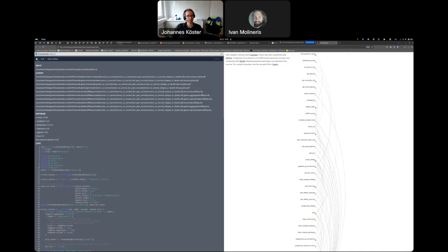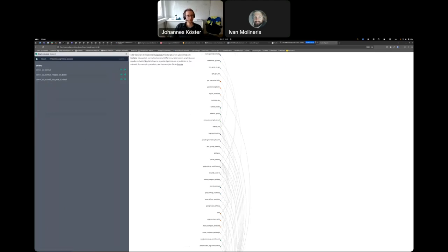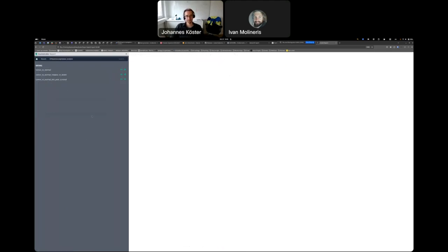So generating lots of transparency without requiring the reader or the assessor or reviewer of a workflow to be an expert in your code base and understand every little detail, but they can basically navigate graphically. And you get all of this for free, no programming involved at all. The only thing you need to do is annotate the results, as you've seen before. And now we can look at some really complex DATAVZRD reports.